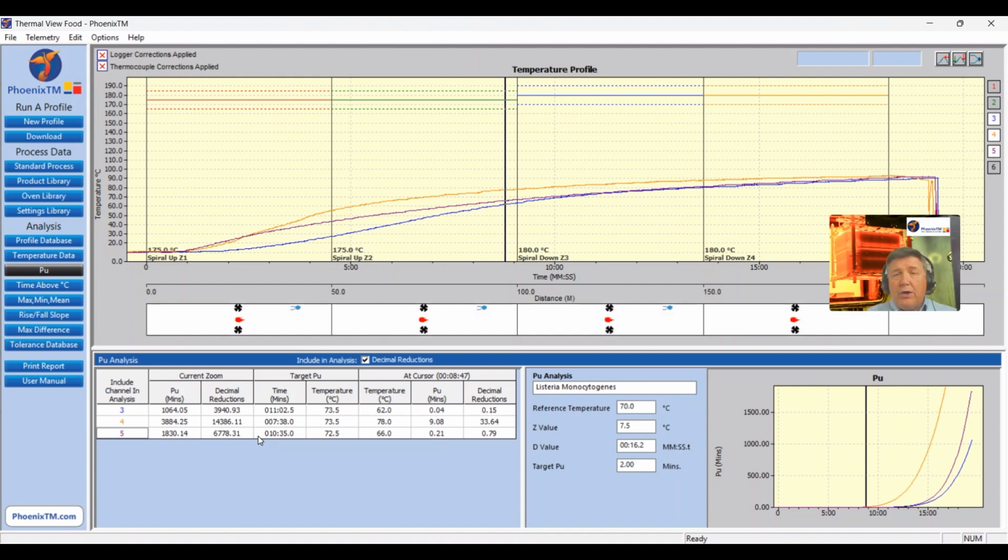So you could argue that we're actually cooking the product far more than we need to achieve the safety. Remember, be careful that you are balancing product safety with obviously the requirements of the cook to give both the characteristics of the product, so the coloration, the browning, and also the tenderization of the meat, and making sure it is fit for consumer from an eating experience perspective.